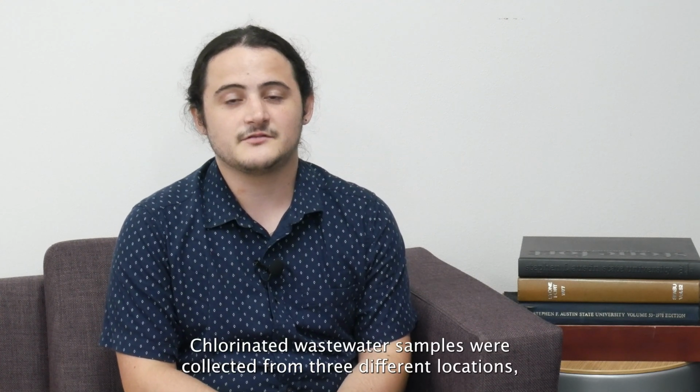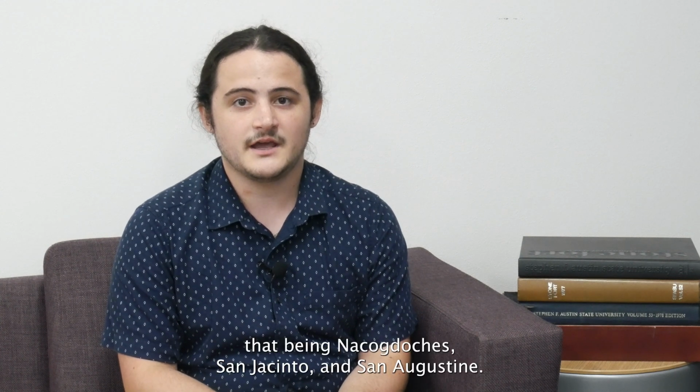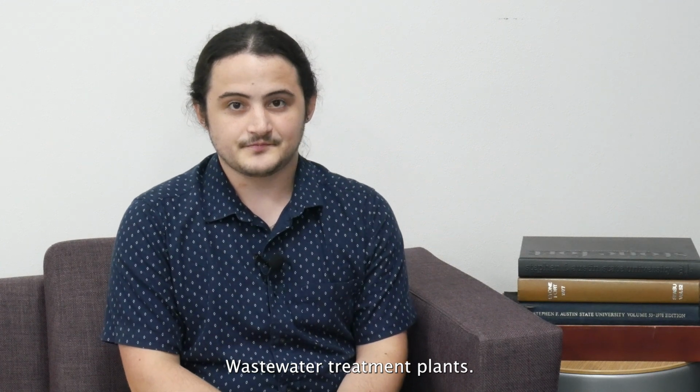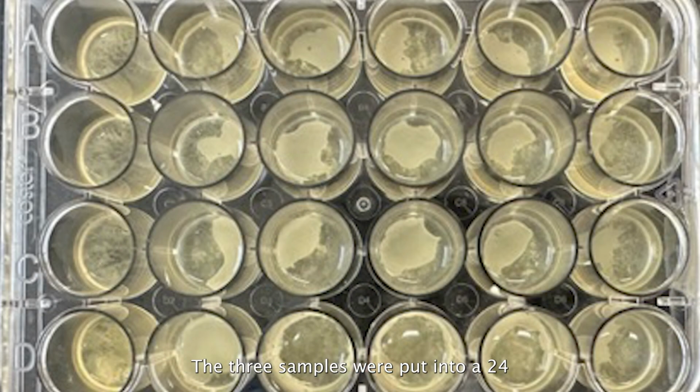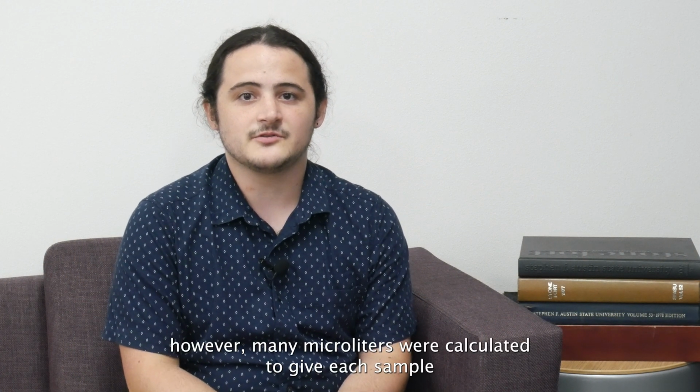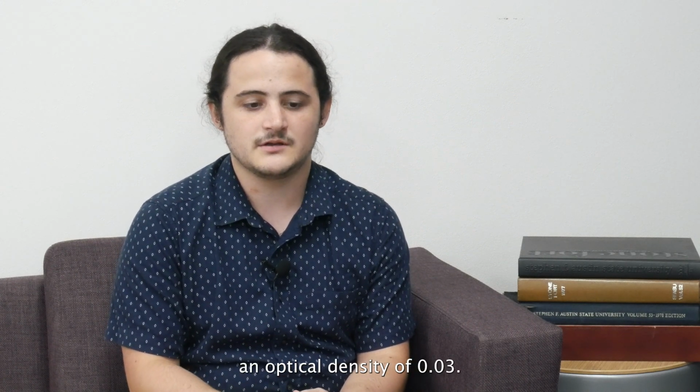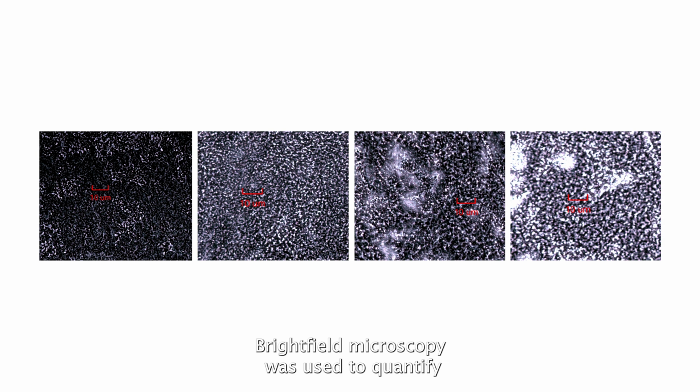Chlorinated wastewater samples were collected from 3 different locations, that being Nacogdoches, San Jacinto, and San Agustin wastewater treatment plants. The 3 samples were put into a 24-well plate alongside sterilized water and tap water, and each well contained 50% LB and 50% sample, as well as however many microliters were calculated to give each sample an optical density of 0.03. Bright field microscopy was used to quantify the amount of biofilm growth.